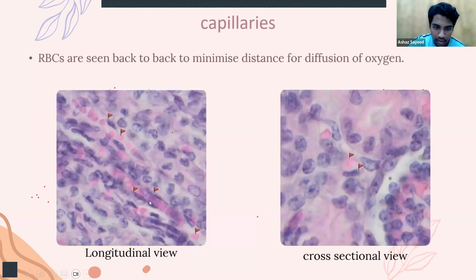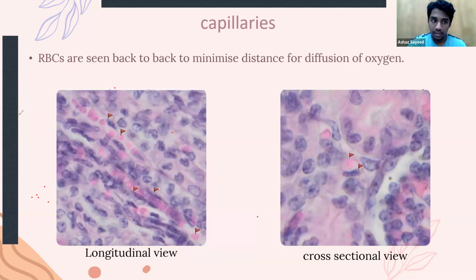This thing is important. If you want to identify capillaries, look at the cursor. You can see these cells in there.